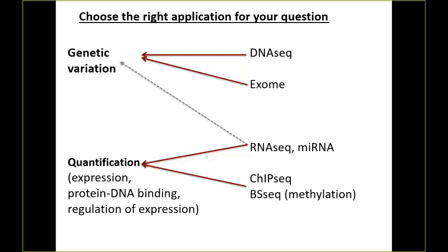They're designed to work on genomic DNA, and if you give them RNA-seq to analyze, sometimes they'll detect that there's a splice site there and they'll kind of know how to deal with it. A lot of times, there's a ton of bogus variant calls right around known splice sites. So that's the first problem.